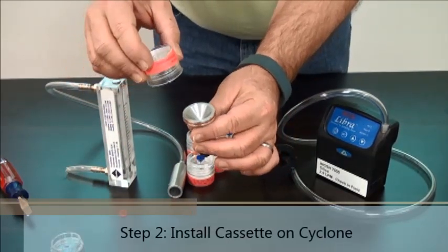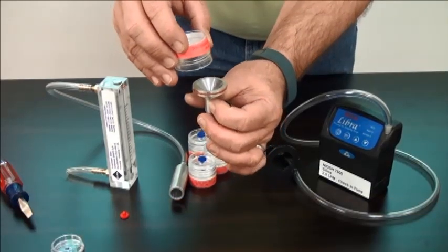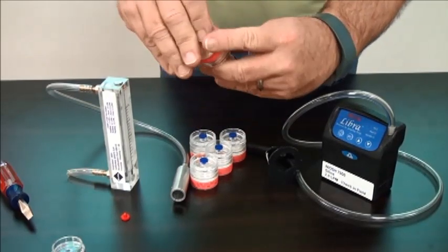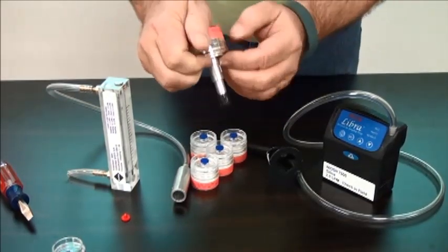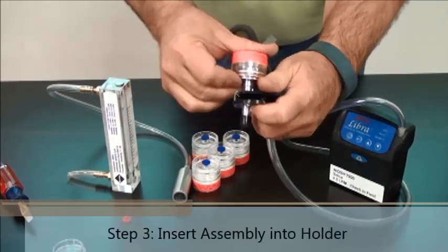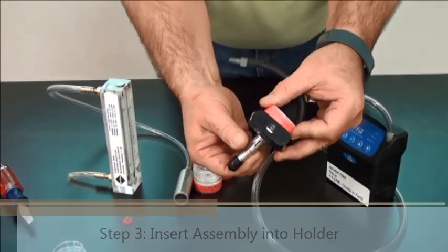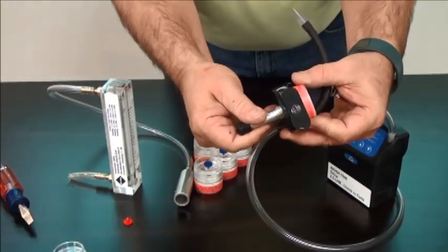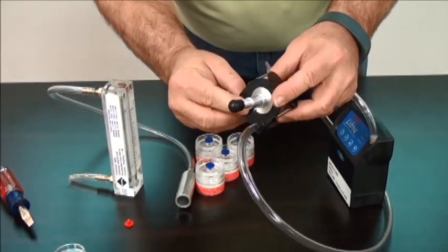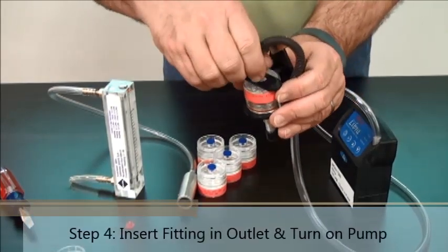Install the cassette on the cyclone. Always make sure the cyclone stays upright with the wide part facing up. Press the cyclone in until it seals. Insert the assembly into the cassette holder, noting the index mark at the bottom.